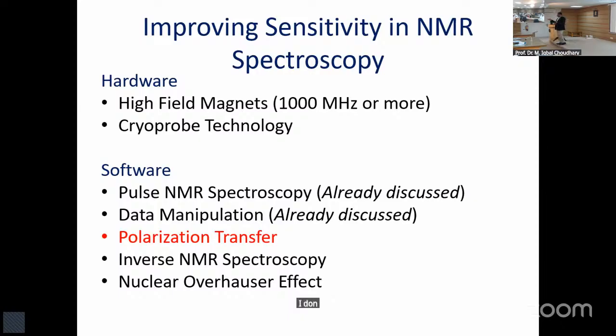I don't know how much in centigrade. If you cool your electronics in the probe with gaseous helium, remember that everything which is electronic performs well when it is cold.